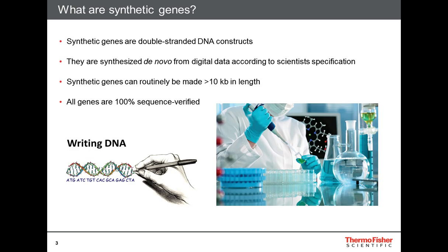So what are synthetic genes? I think by now it's really a commodity. It wasn't that way when we started with GeneArt some 16 years ago. Synthetic genes are double-stranded DNA, of course, and they can have any length. We routinely synthesize over 10 kb genes in length.